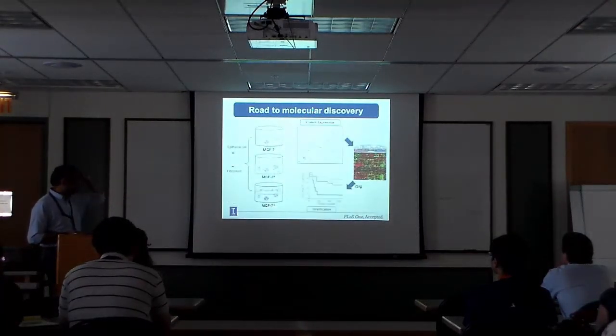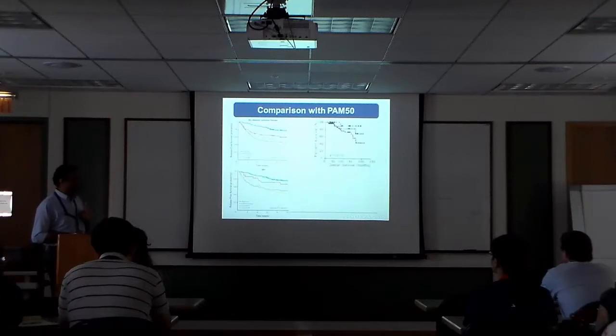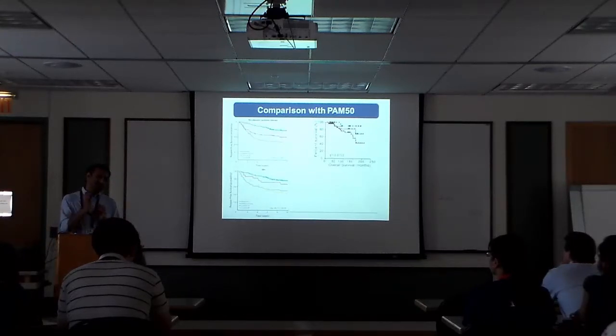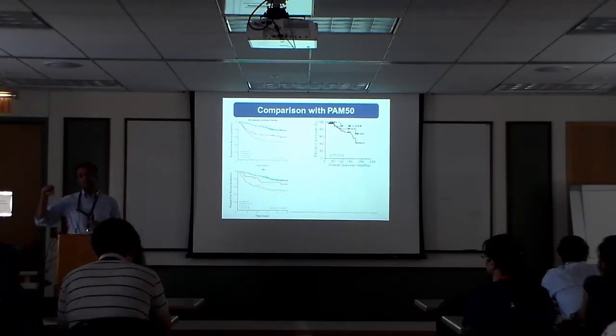This is now online, so I won't explain this. But what we've been able to do, I'll just explain this curve. What we've been able to do is figure out the heterotypic interaction between breast cancer cells that are just starting to proliferate and fibroblasts with a set of 46 proteins.